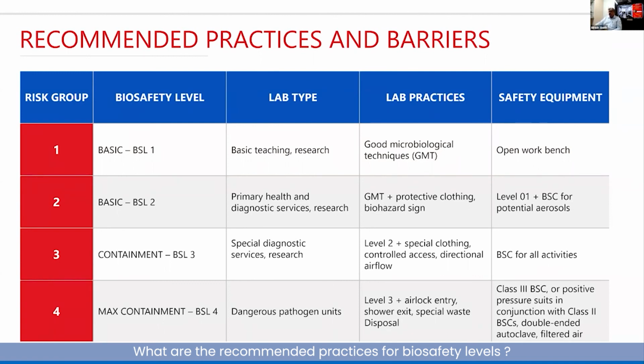So these are the physical barriers which are recommended. And when I say these are recommended, I would like to underline here that it is not the only thing which has to be done.